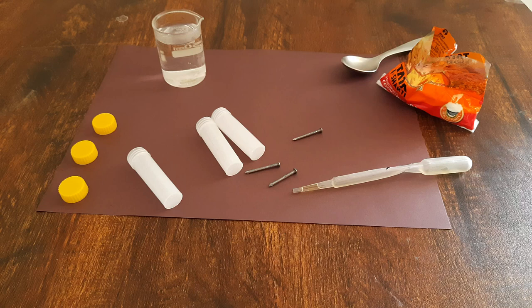In this activity we will explore rusting of iron. For this activity you need a bunch of stuff: three plastic tubes or test tubes, three iron nails, some baking soda, some boiled water, and a dropper with some oil in it. We will start by adding some baking soda in one of the plastic tubes.